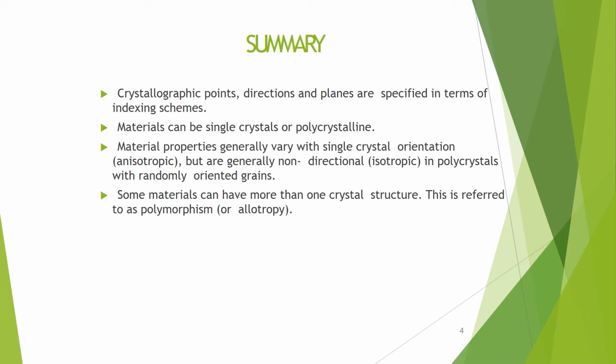Material properties generally vary with single crystal orientation, that is, anisotropic properties, but are generally non-directional, isotropic properties in polycrystalline materials with randomly oriented grains.